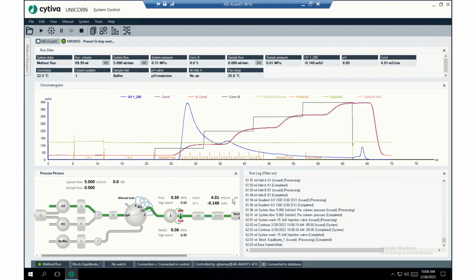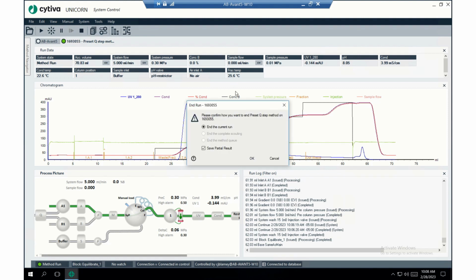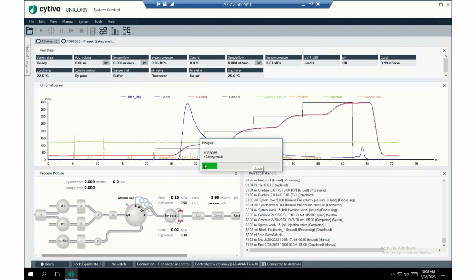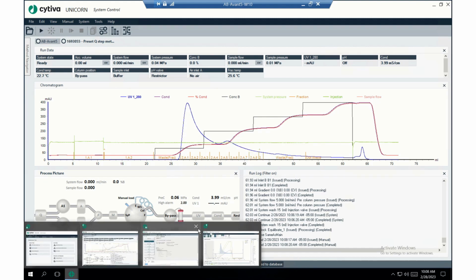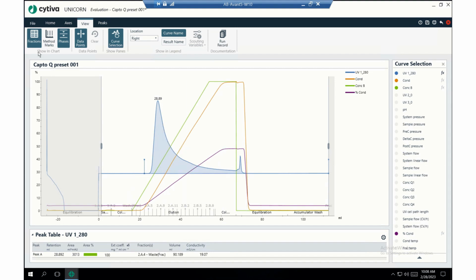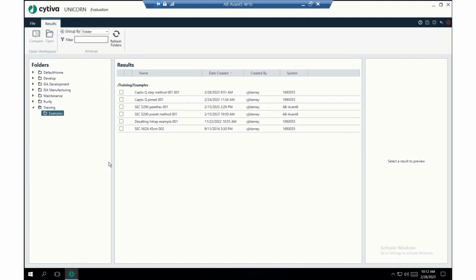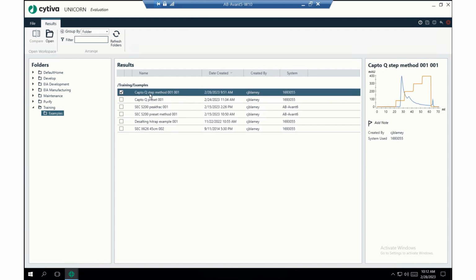I'm going to stop the run here, just because I'm doing this for demonstration purposes. Most of the salt is out of the column anyways. Save the partial results, end the current run, okay. Alright, let's see if we can view the results here. Evaluation. Okay, so here is our Capto Q step method. I'm going to go ahead and open that.